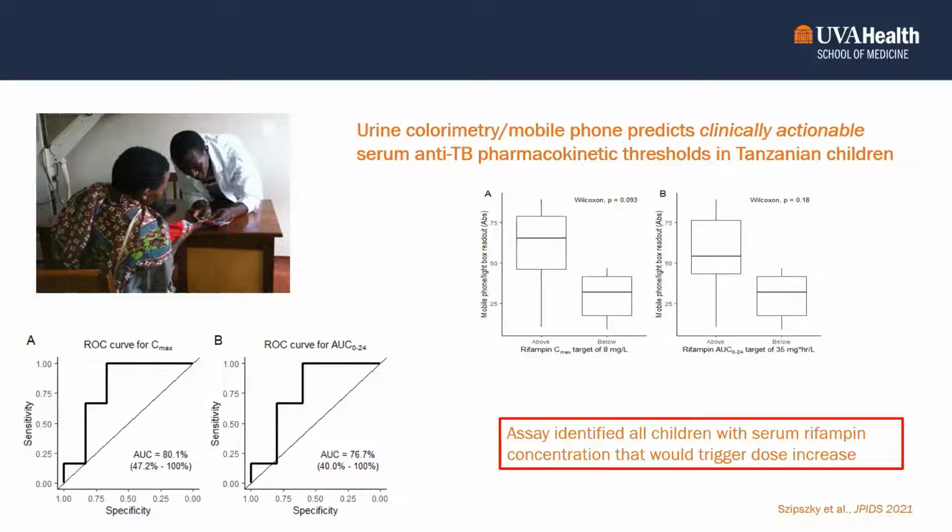So in conclusion, for just this study, it's still a proof of concept, but it tries to bring colorimetry one step closer. And the purpose for trying out this light box was that initially we had difficulty even getting a spectrophotometer shipped to Tanzania. So they weren't able to buy one themselves. We had to buy it from Virginia and then ship it all the way to Tanzania. And even shipping is a bit challenging because there are only a few companies that ship equipment or samples, maybe even dry ice shipments.